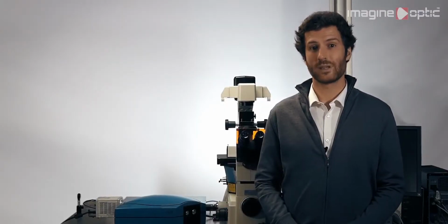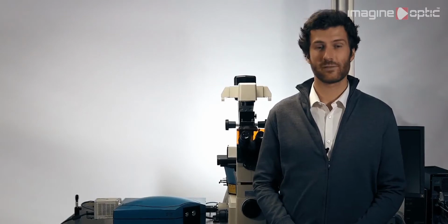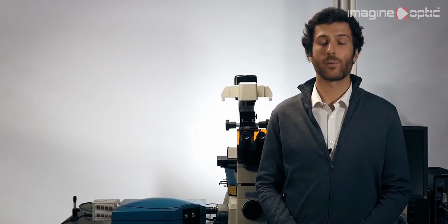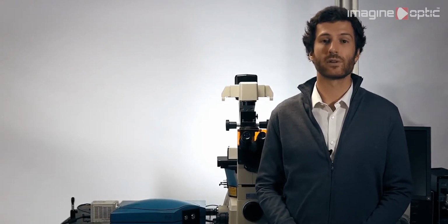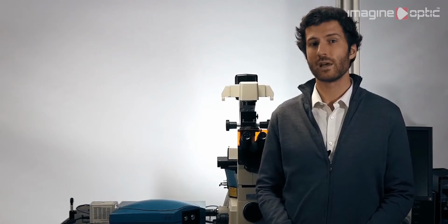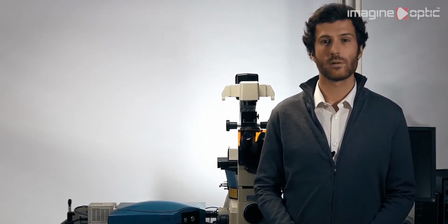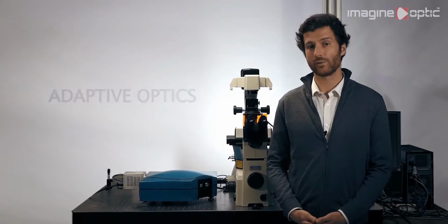Among other physical phenomena limiting achieving a better contrast, resolution, or imaging depth, optical aberrations are almost inevitable, whether they come from the optical setup or the sample itself. Although there are a number of different techniques to minimize aberrations, it's almost impossible to fully correct them for every sample at every depth. This is where aberration correction using adaptive optics proves itself useful.